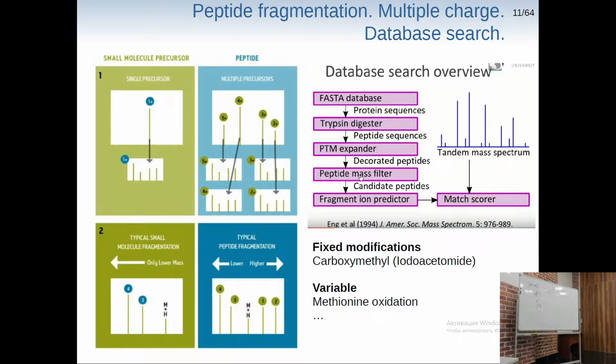Alright, let's say we have some sequence and some characters. We have an amino acid which will be cleaved here, right? And will those small fragments, let's say something here and here, be of any use?